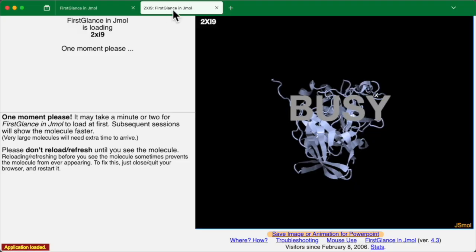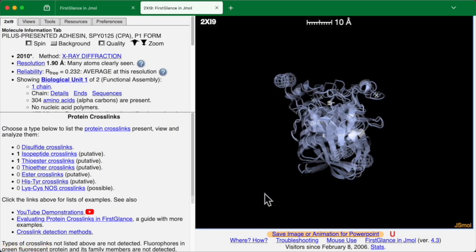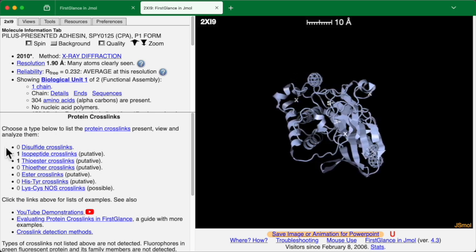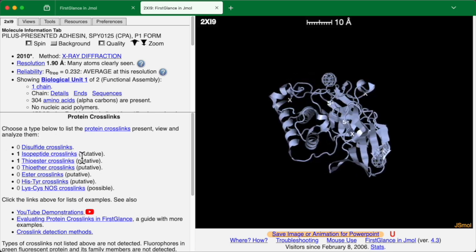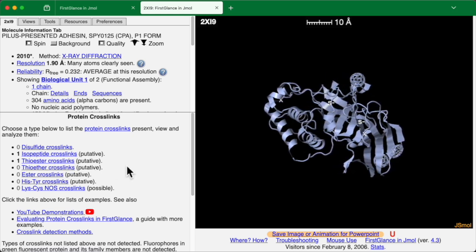A new browser tab opens and it says right away, unusual protein crosslinks may be present. OK to list them. I'll press OK. Now we see a list of crosslinks indicating one isopeptide and one thioester.